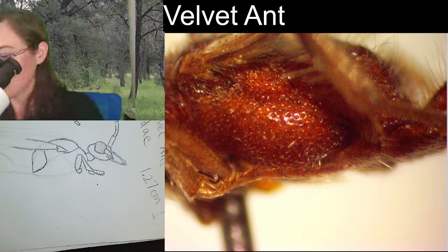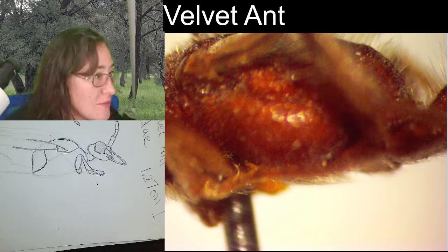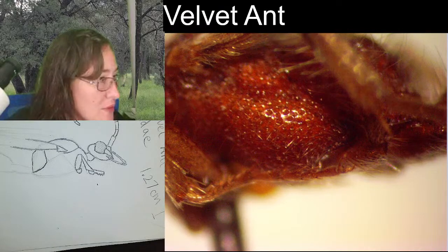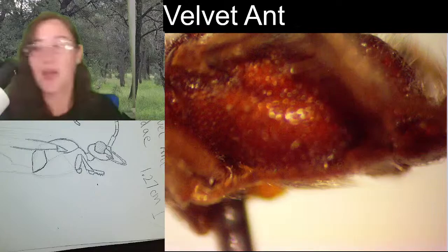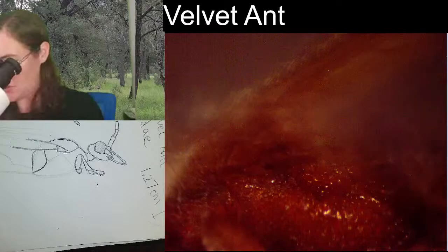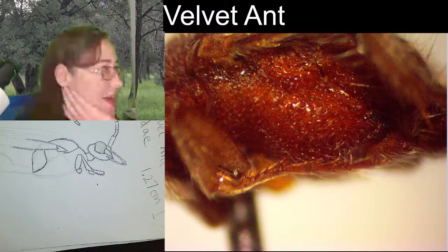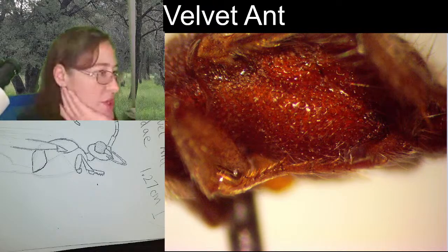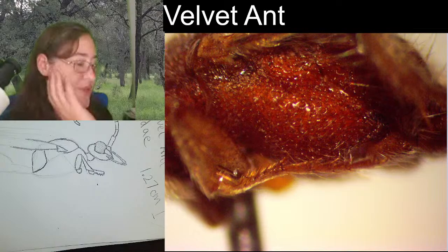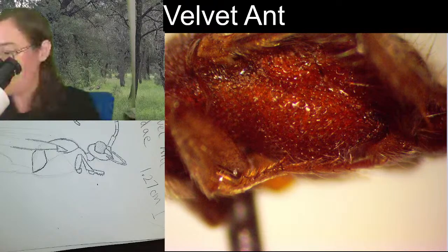I always want more light on the microscope. Alright, and then we have, if I turn this just this way, I think we can get all of the segments in focus at the same time. There we are. Okay, so now we have 1, but 2, 3, 4 are all these triangular segments with spiny looking doodads on each side, and then the fifth one is more of what we call a raindrop shape segment with the two claws.